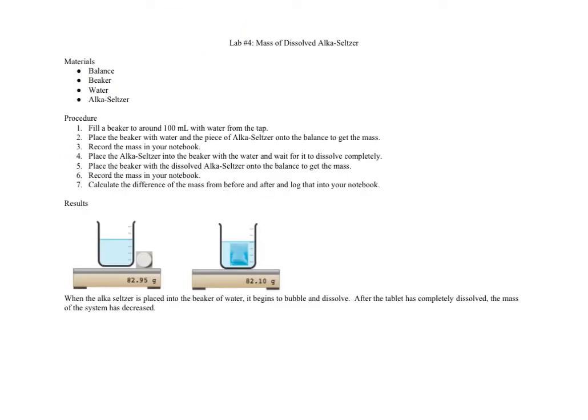Lastly, I've got a beaker and an Alka-Seltzer tablet on the balance. On the left, this is the water and the Alka-Seltzer tablet, and on the right-hand side, we've got the Alka-Seltzer actually in the water.